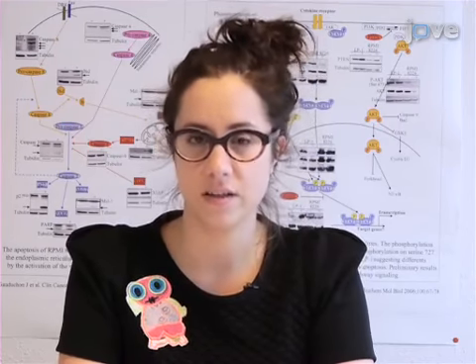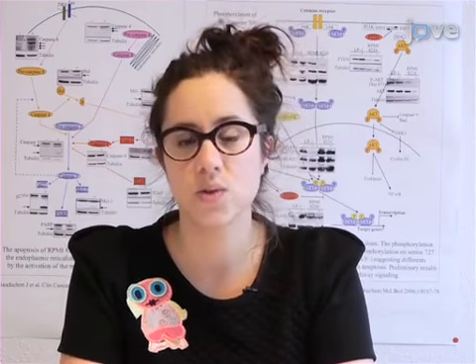Although we use this technique to detect senescence on cancer cells, it can also be used on normal cells. This method can help answer quick questions in the cancer field, such as whether a chemotherapeutical drug induces cancer cells to senesce, which might promote malignancy. Thus, this technique could ultimately help identify new therapeutical treatments for cancer.